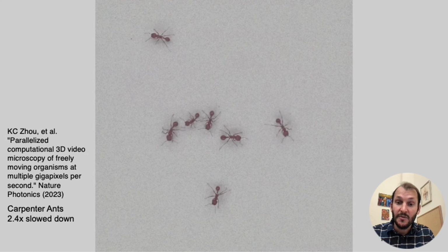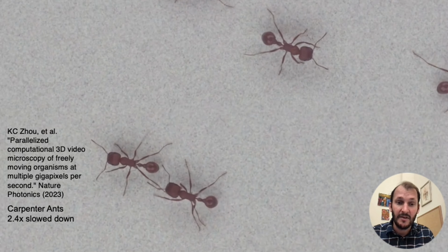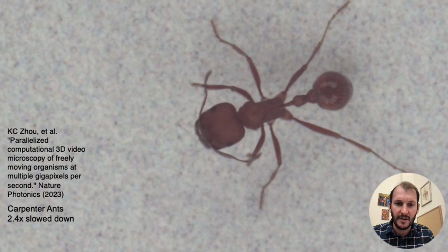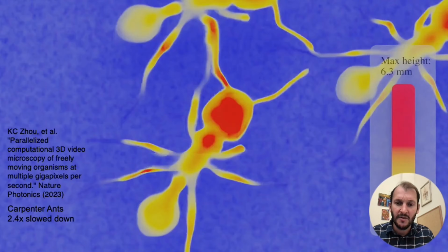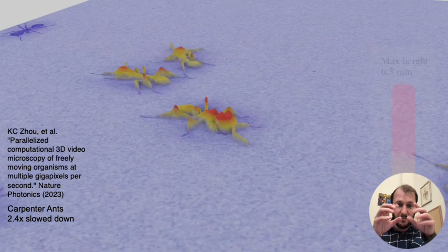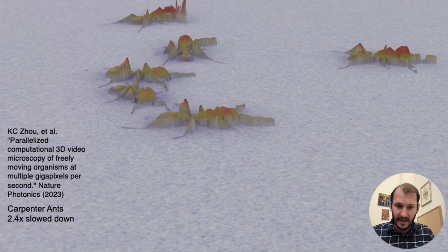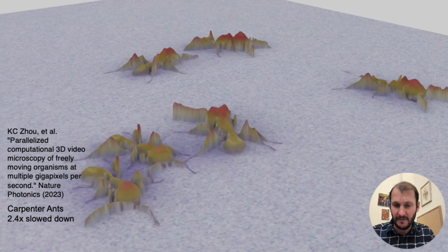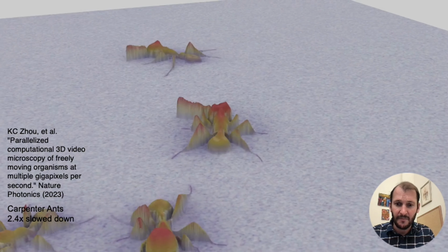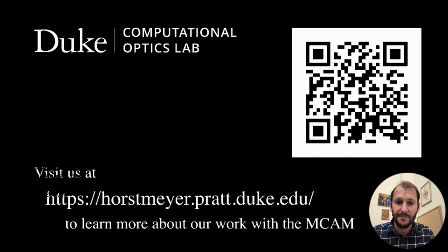So we've used this new microscope for a couple interesting demonstrations. In one, we configured it to capture 3D images. And so here's an image of freely moving ants, or a video rather, of freely moving ants that we captured. And what we're able to do is slightly change the imaging plane such that more than one camera sees each point in the field of view, which allows us to use stereoscopic or photogrammetry software, which is software that takes multiple perspectives to then fuse a 3D image result.